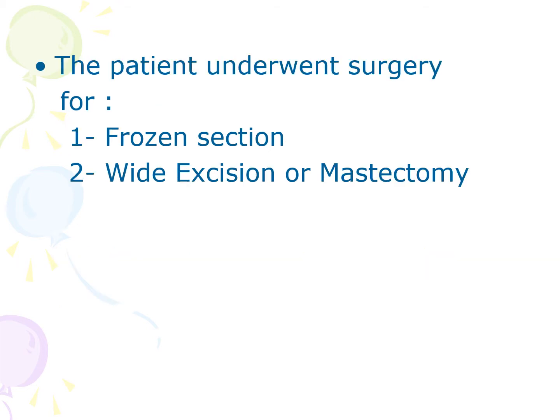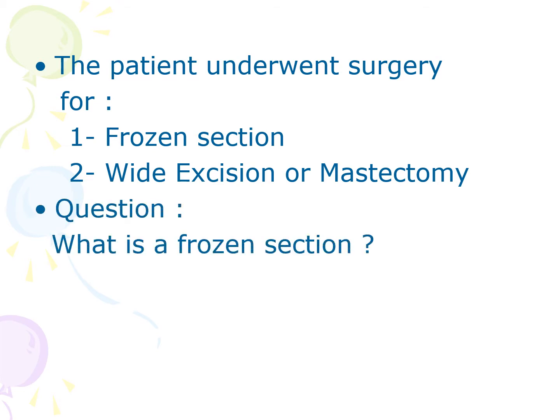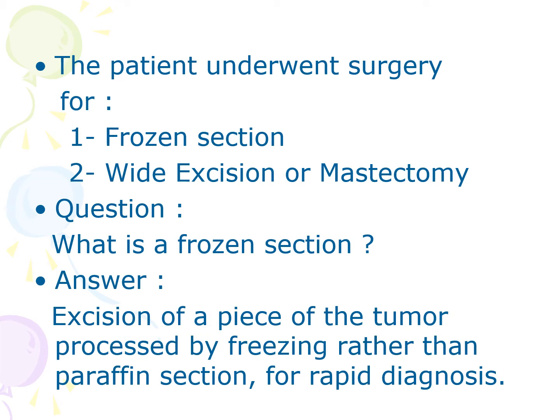This patient underwent surgery for a frozen section and wide excision or mastectomy. What is frozen section? It's a technique to perform a rapid microscopic analysis of the specimen to provide immediate report. The sample is processed by cooling or freezing rather than paraffin section.